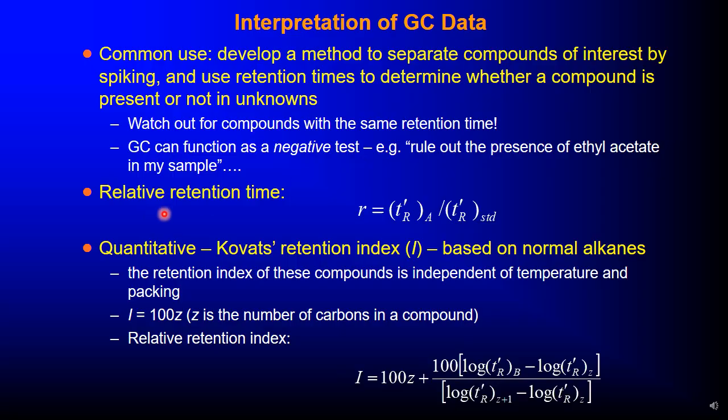Relative retention time, you can work out that of the analyte and that of the standard. For quantitative work, convert to retention indexes based on normal alkanes. The retention index of a compound is independent of temperature and packing, and that is so important when you are doing quantitative analysis with gas chromatography. There is already a library of relative retention indexes.